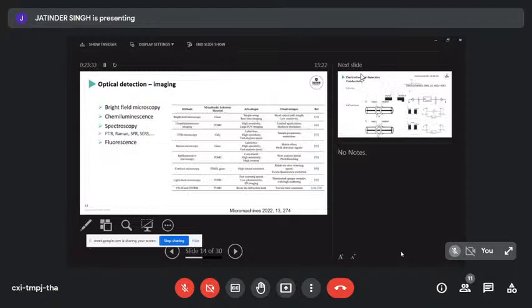This here is an overview for you to have an idea where there's a whole range of different optical methods, typically done in glass or PDMS, unless you do FTIR, because then you need to have your calcium fluoride as a microfluidic substrate. All of them have their advantages and disadvantages in terms of sensitivity and complexity. But we've got the range of options that are open for detection, for large-scale microscopy as well as analytical instrumentation. It's all available for microfluidic systems as well.